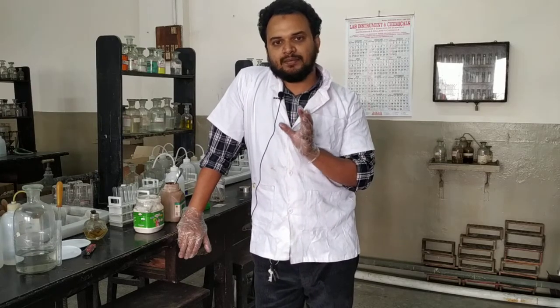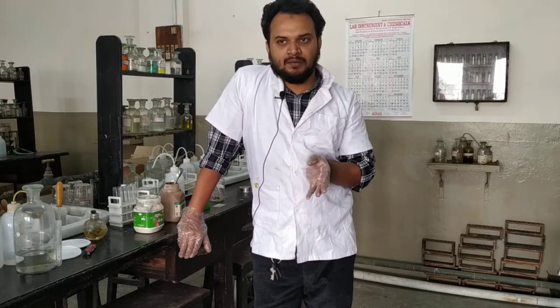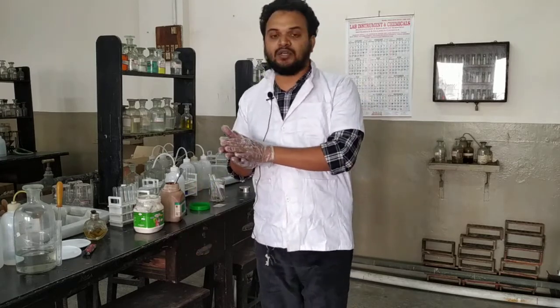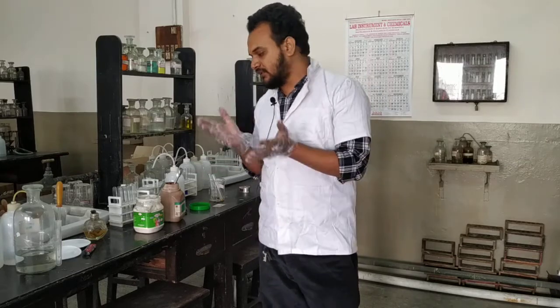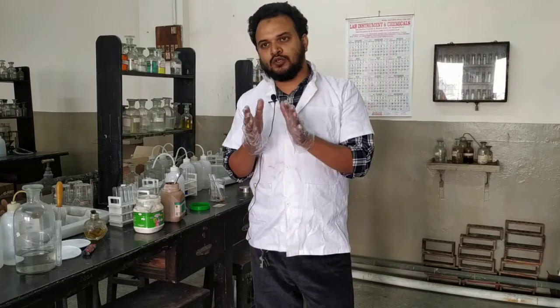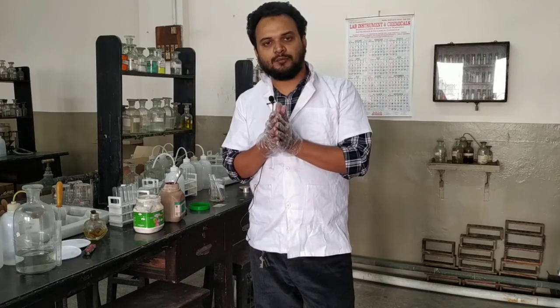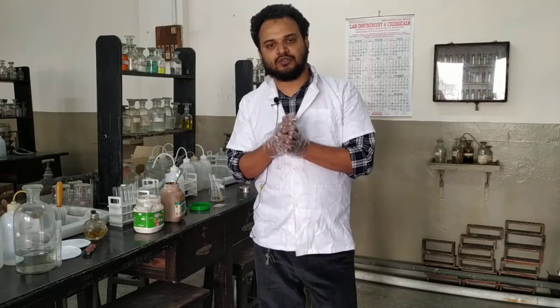This is applicable for pure aliphatic or aromatic aldehydes and ketones. But when it comes to biomolecules, that is polyhydroxycarbonyl compounds like glucose, fructose, if you perform the Tollen's test with fructose, then also you will get a positive test. So Tollen's test is very popular to detect traces of carbohydrate in a food sample.